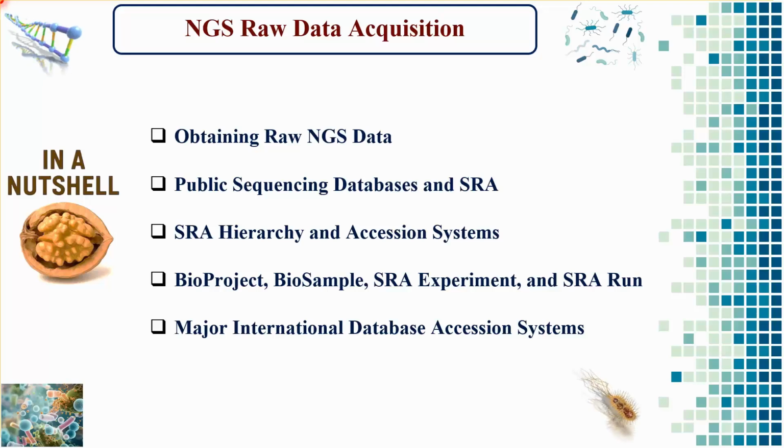In the next lecture, we will explore the methods for downloading sequencing data in detail. We will also demonstrate the download procedure of raw NGS sequencing data step by step and learn how to retrieve real sequencing datasets efficiently for bioinformatics analysis.